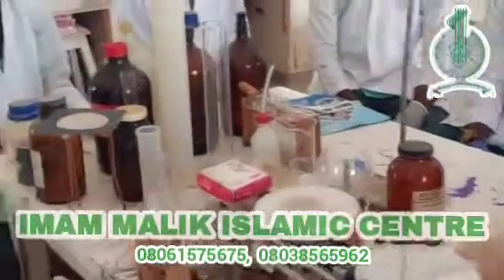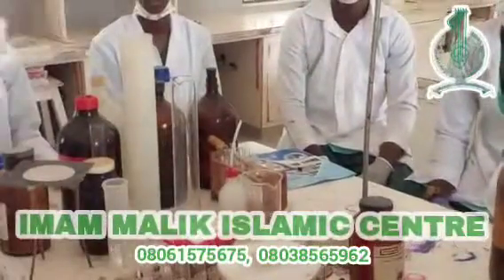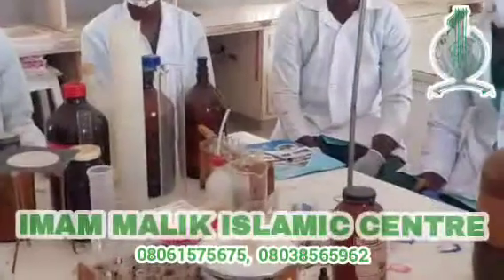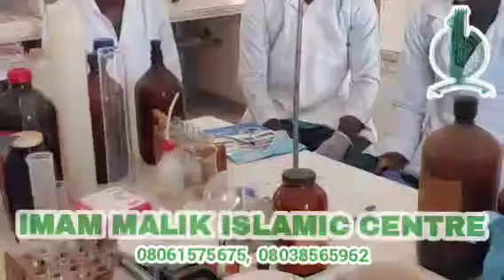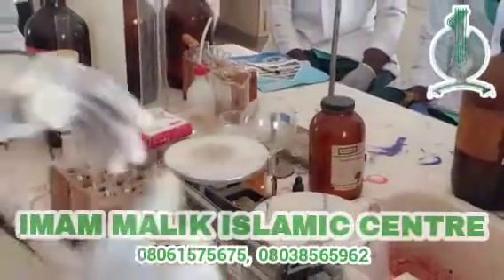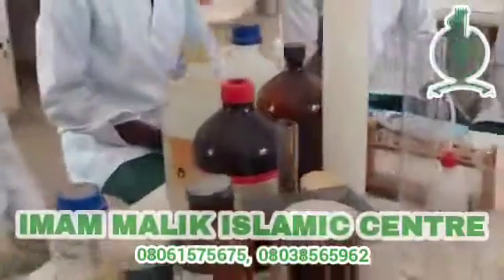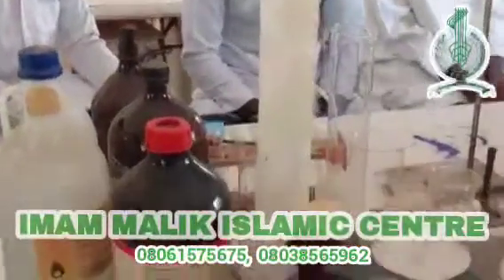And this one is another important factor to consider, because if you are using, let's say, corrosive acid, if you use it on rubber, it is going to destroy the rubber. So this one is also another factor. That is why most of the apparatus are glass in nature, and it is also easy to clean. Please take note of this. I'm going to ask maybe at the end of the class, so you should take note of all this.